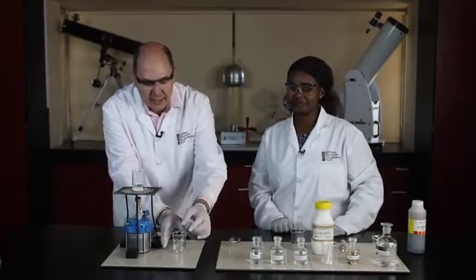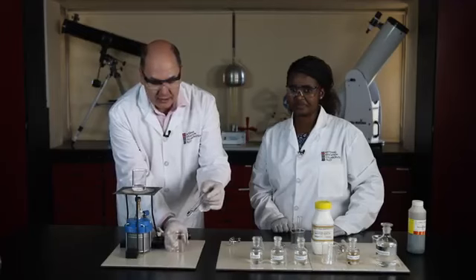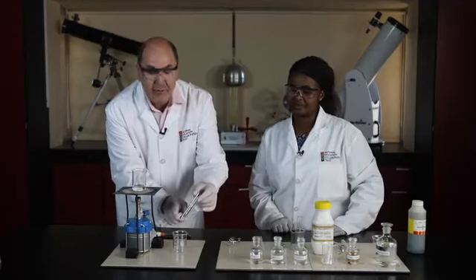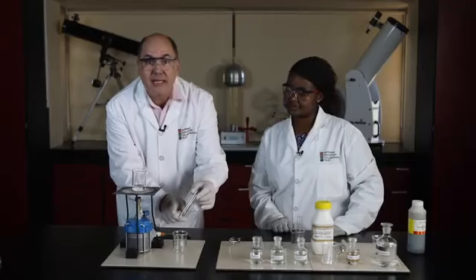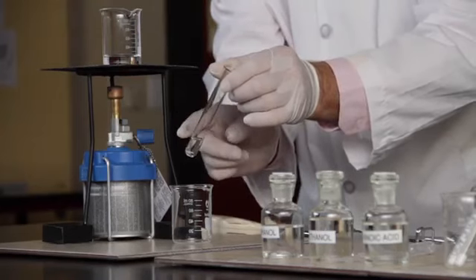Now, the reaction mixture is cool, and so we are ready to do the last part of the experiment. We need to separate the unreacted acid, the ester that's in here, and the unreacted alcohol. This is the last part of the process.